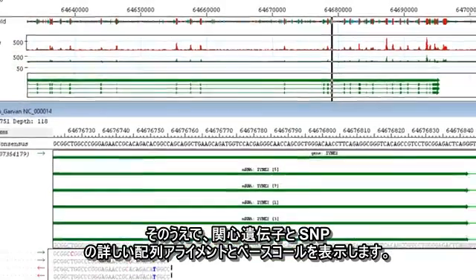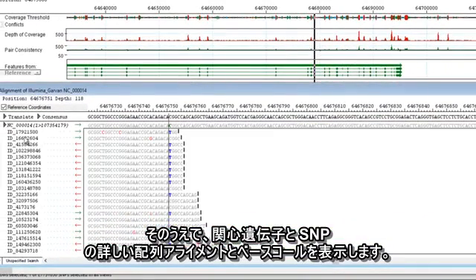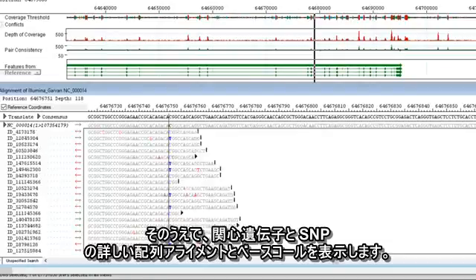Then view the detailed sequence alignment and base calls for genes and SNPs of interest.